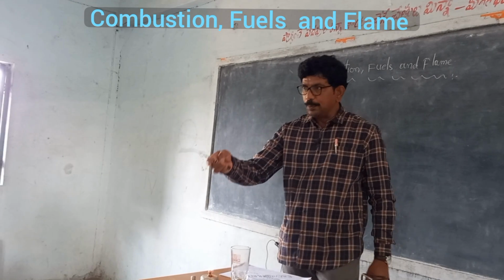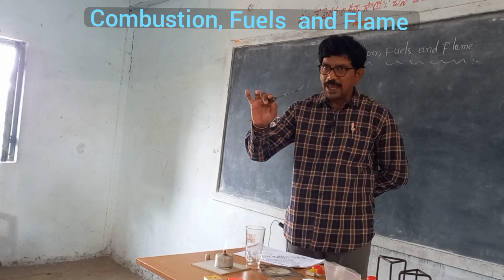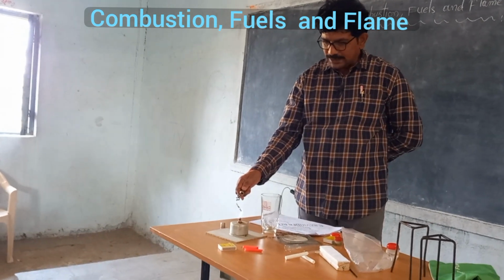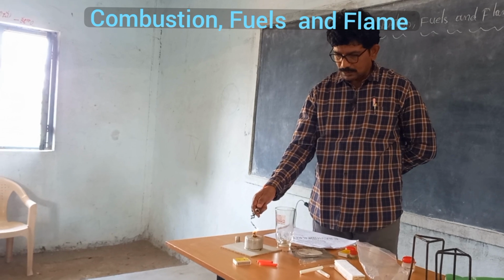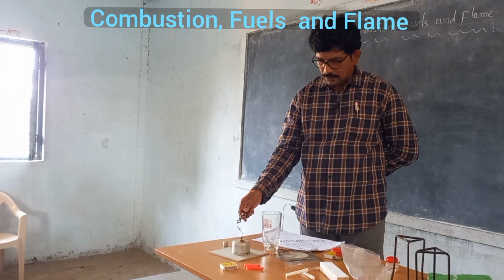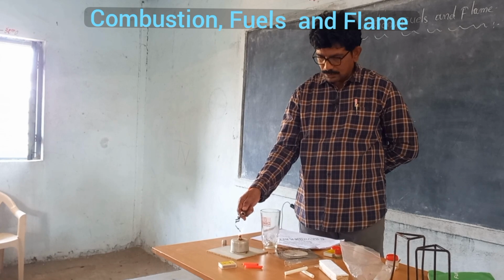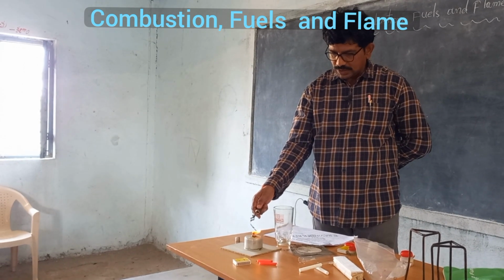Now I have taken magnesium ribbon. This is magnesium ribbon. I hold the magnesium ribbon with the help of the tongs and I am trying to burn the magnesium ribbon. Does it burn or not? Let us check. See, it is taking a lot of time. Observe this. Does it burn or not?